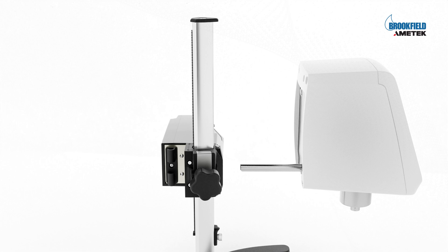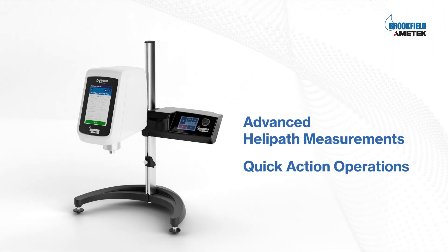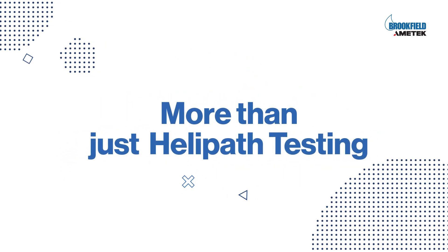Amatec Brookfield's HPQA is for both advanced helipath measurements and quick action operations. This premium viscometer stand is for more than just helipath testing.